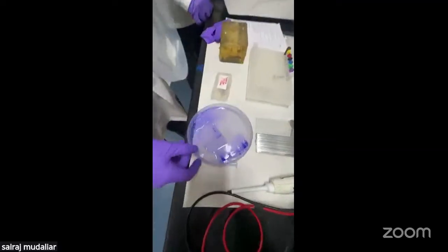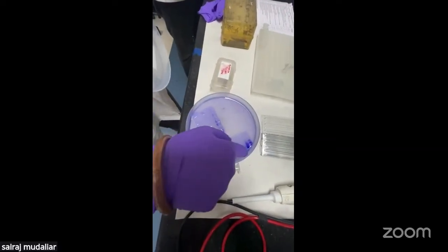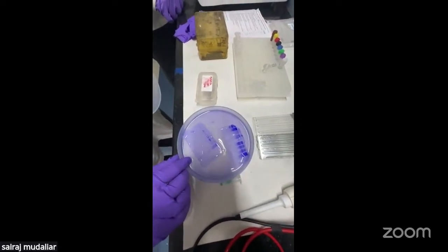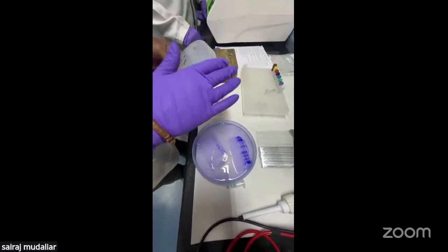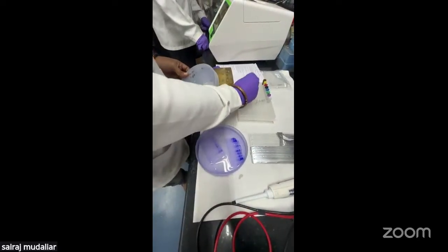So you can clearly see these are the gel bands. And these are the band patterns of the clinical samples that you have. Once this is done and your gel is clear, you can proceed with the digestion, or else you can also perform two-dimensional gel electrophoresis.